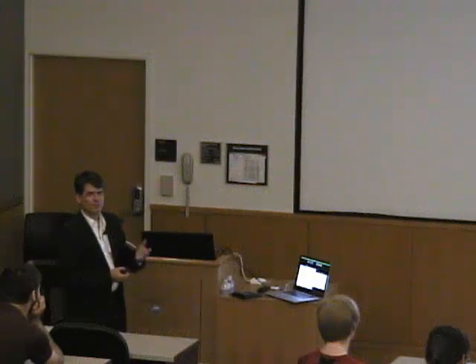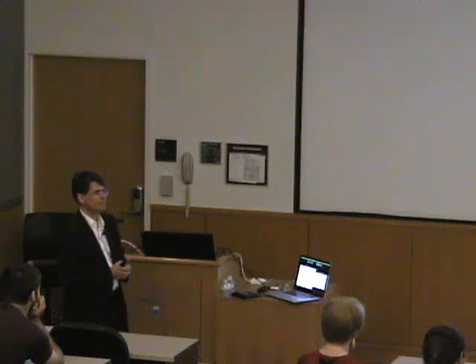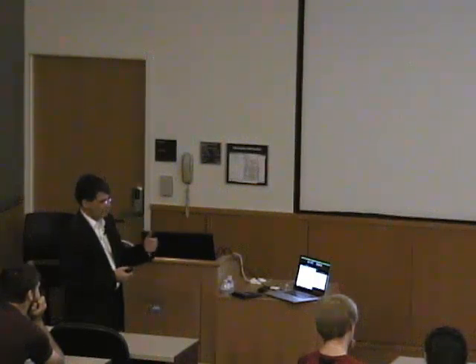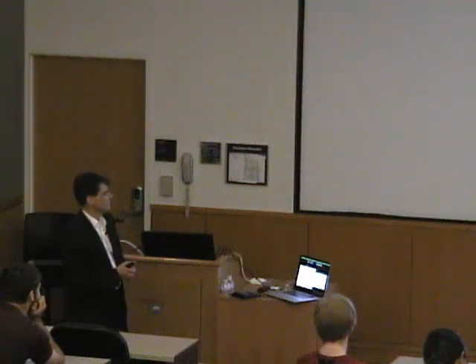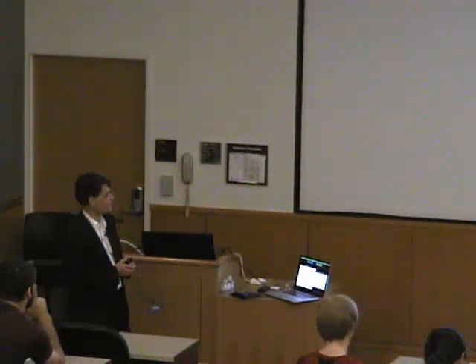The phenomena that you observe, namely transitions between different states of the system, happen on an energy axis. So if you pass from wavelength to wave number, which is 10 to the 7 divided by lambda, then you have a scale that is linear in energy, and that is a much fairer display of what is actually happening in your molecule.